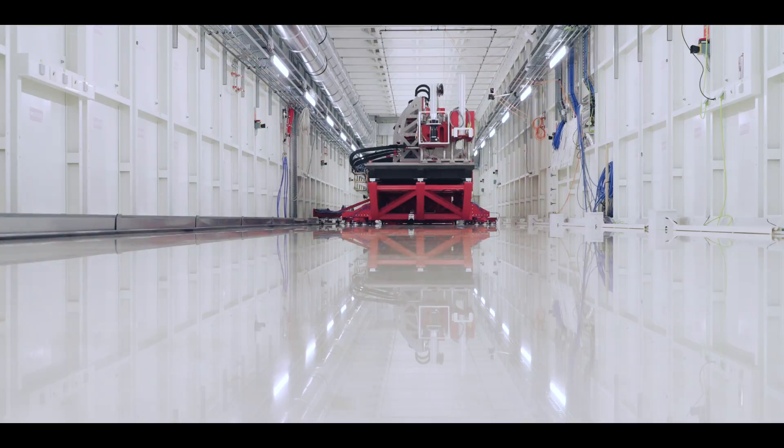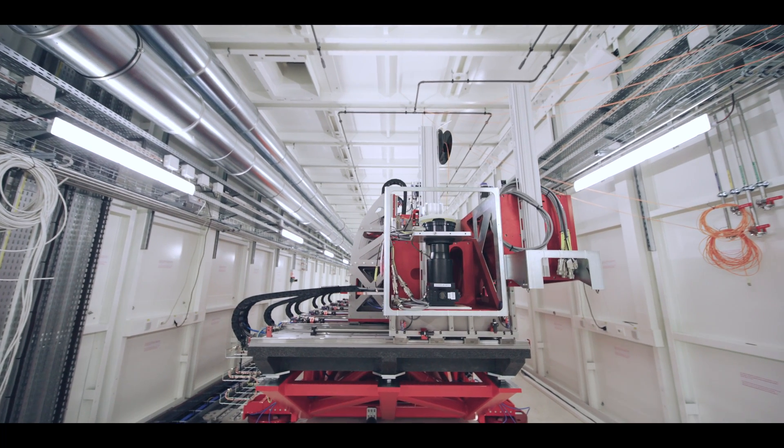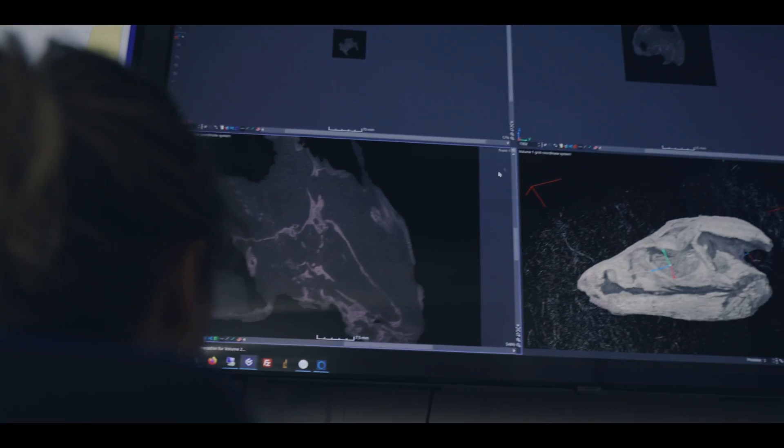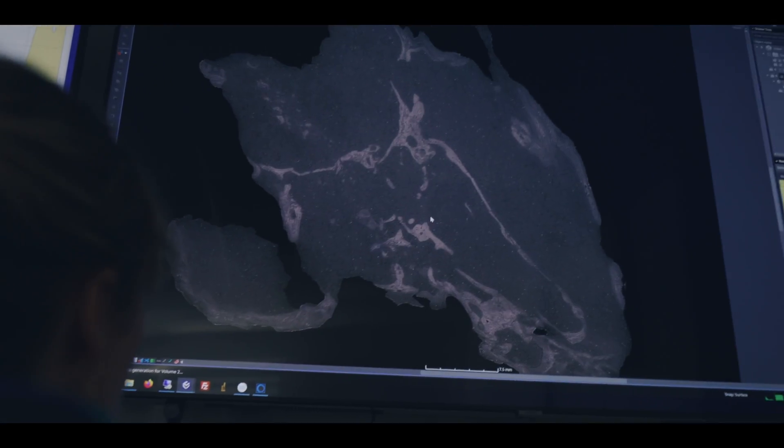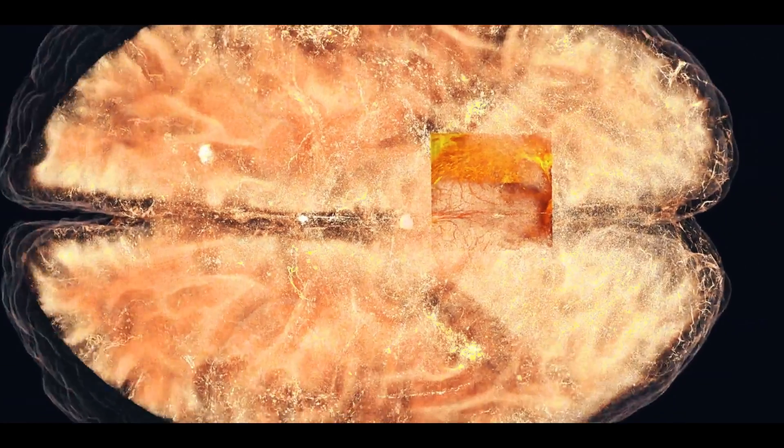We are on BM18. It's a very long beamline that fully exploits the capabilities of the new source at the SRF. It's dedicated to tomography to make multi-resolution from very large scale up to 2.5 meters down to submicron resolution.